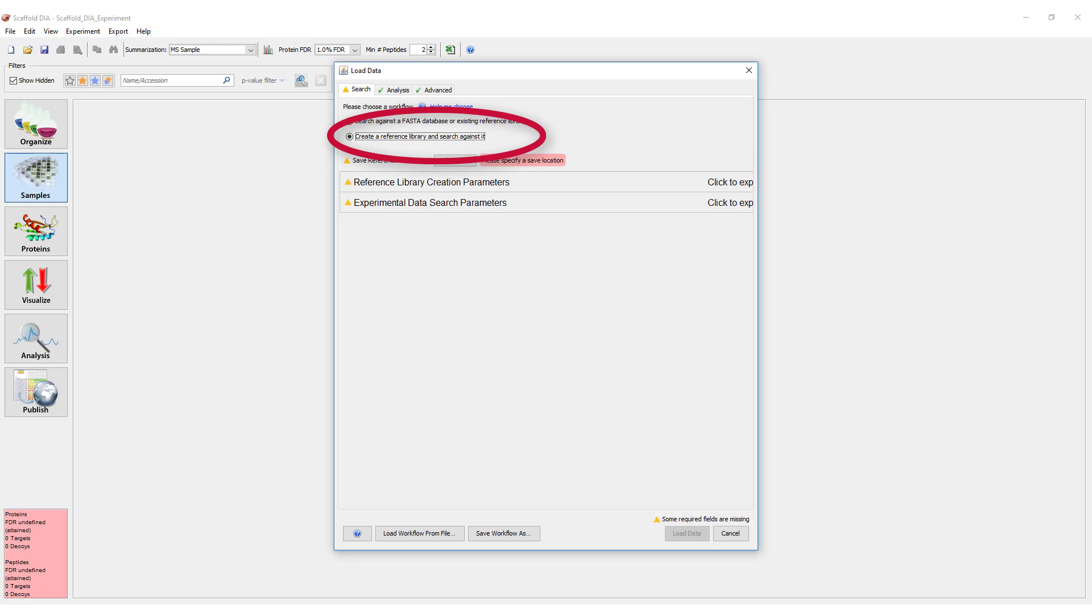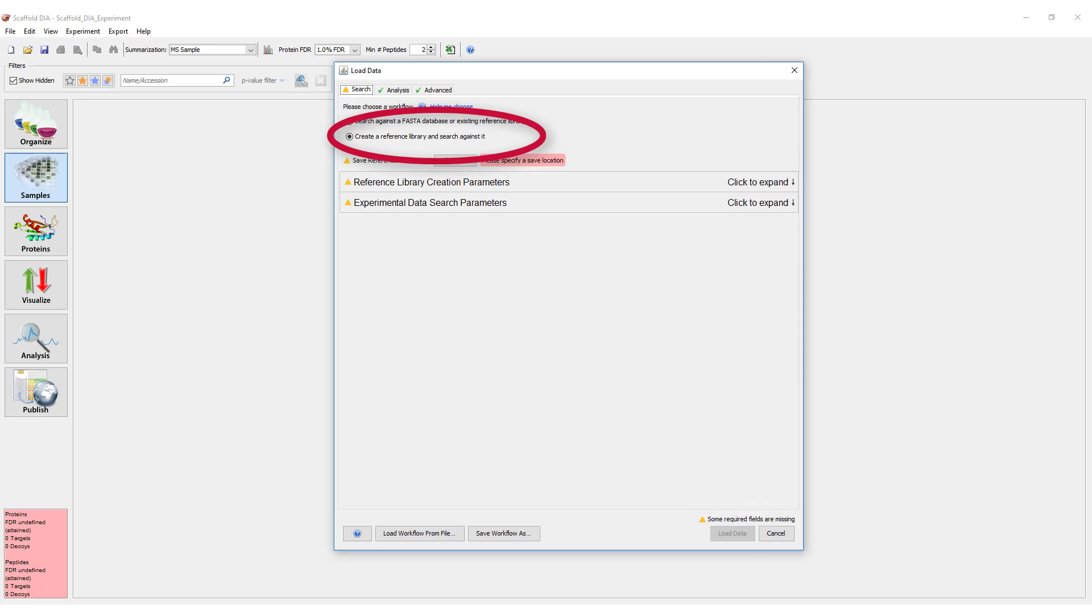Option 2 allows you to create an ELib chromatogram library file from reference DIA data and search experimental DIA data against it.